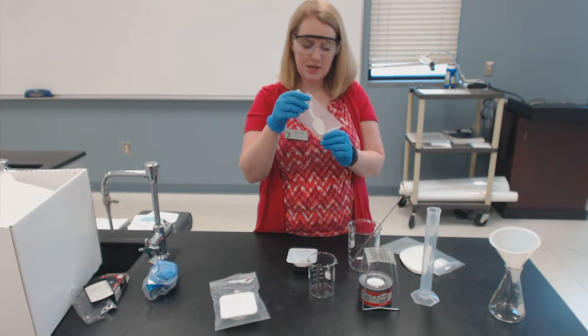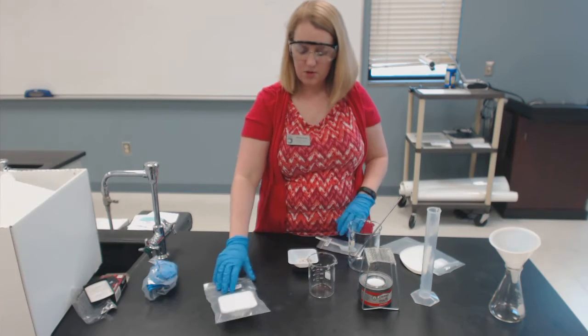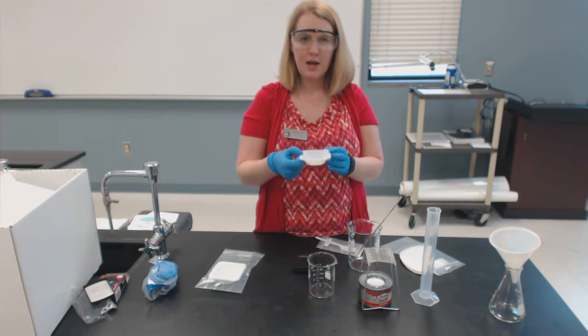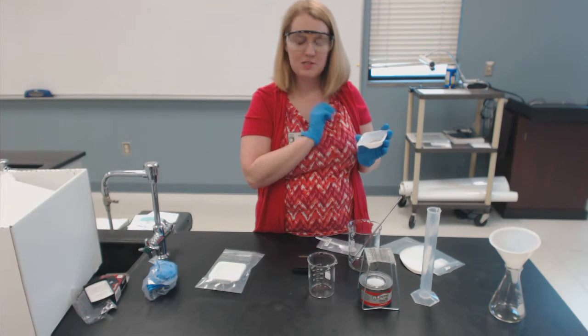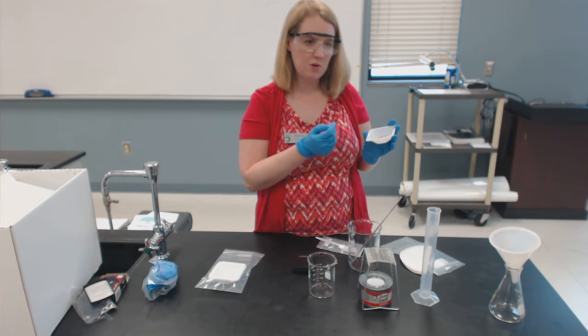So your salt and sand mixture, you're going to weigh out approximately 2 grams. So your weigh boats that also came in your kit, weigh out approximately 2 grams of this, and then come up with a method of determining what percentage of this is sand, what percentage of it is salt, and what percentage of this is ammonium chloride.